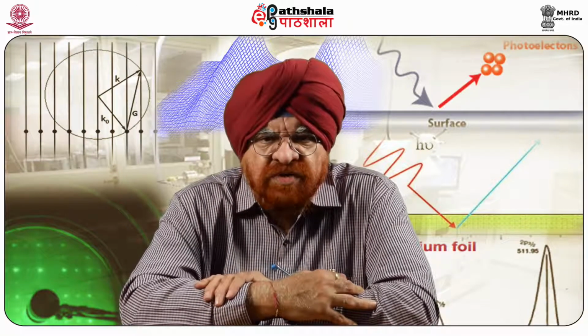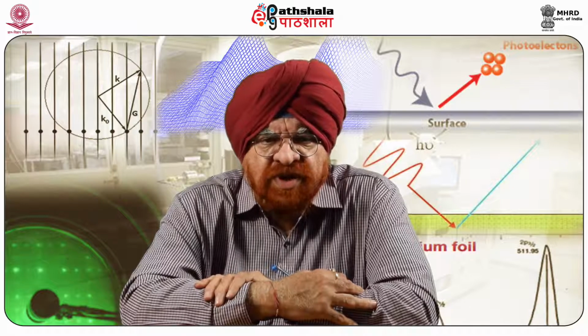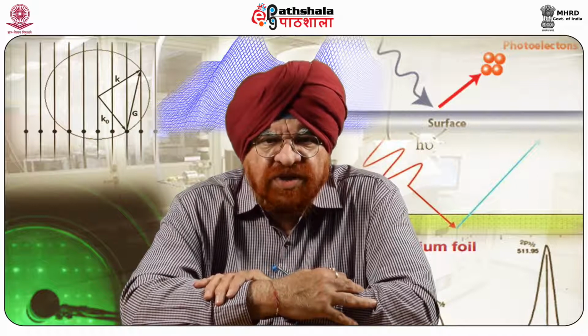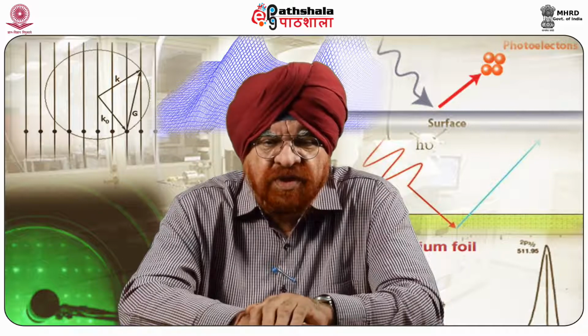On one hand, the AFM can resolve very tiny features, even single atoms, that were previously unseen. On the other hand, the AFM can examine a field of view larger than 125 microns, that is 0.005 inch, so that you can make a comparison of the other information.